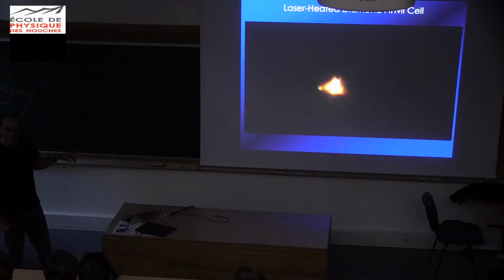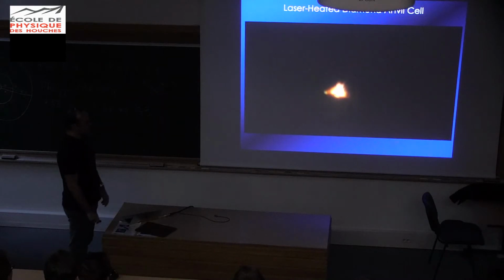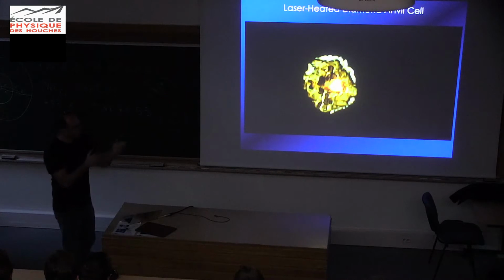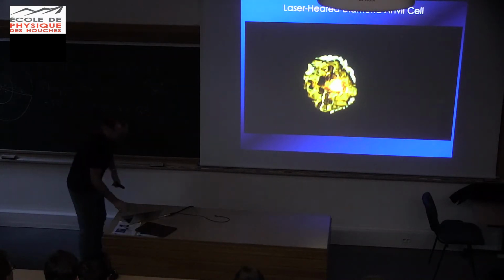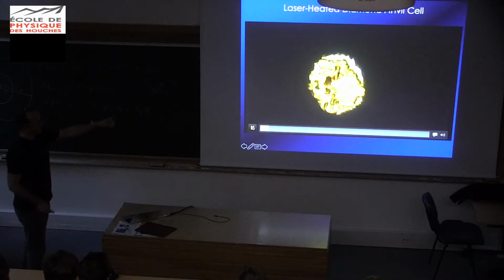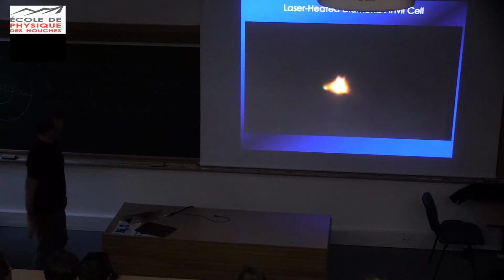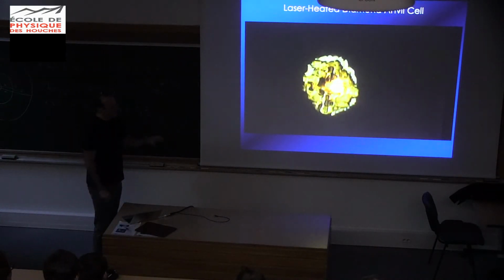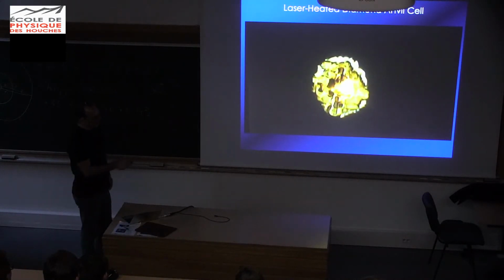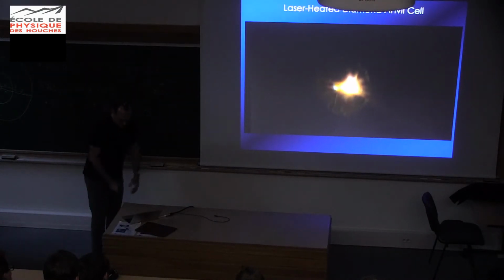I'm looking now. Yeah, I'm looking through the diamond. Actually, I'm filming a TV camera, with my phone. That's why it's moving. But otherwise, it's perfectly static. You see that my hand is moving, but the thing itself just doesn't move. And your laser is here, and it's very bright. Oh, and turning off the light and on to see the sample. And when you turn it off, the only source of light that you have is the light emitted by thermal radiation. That's about 2500 C.